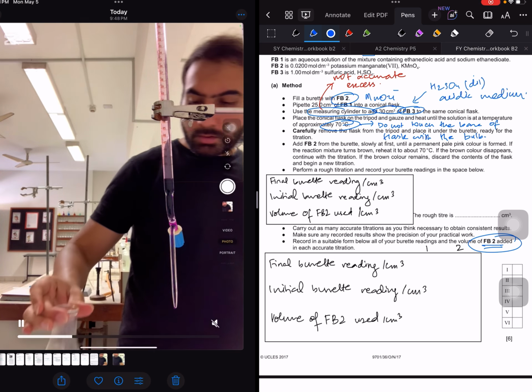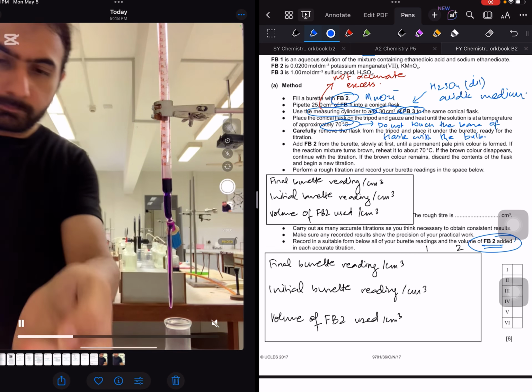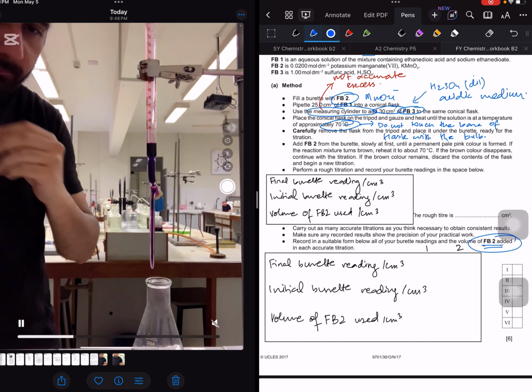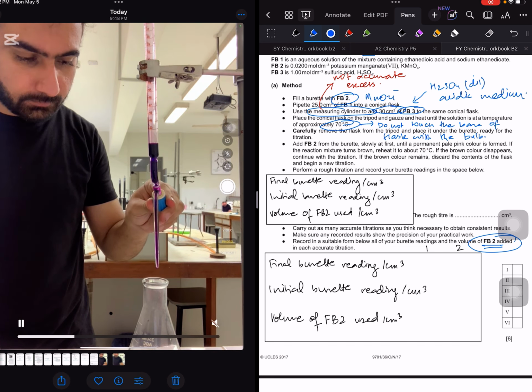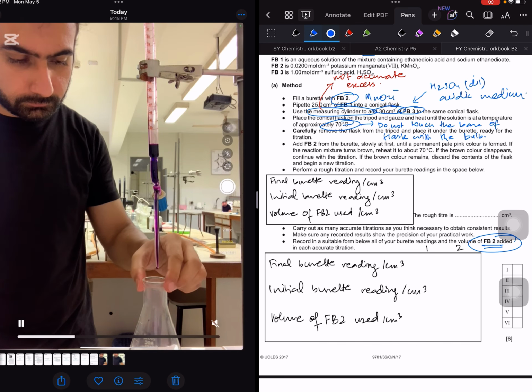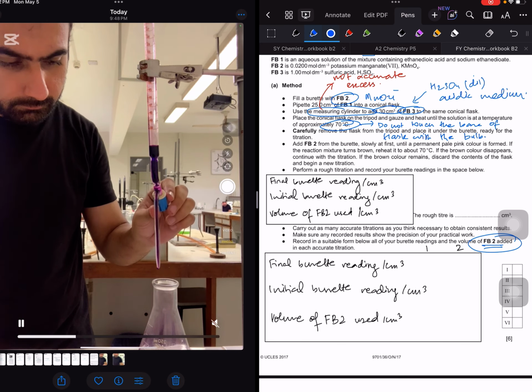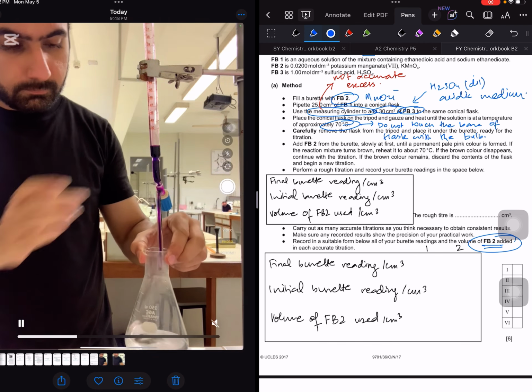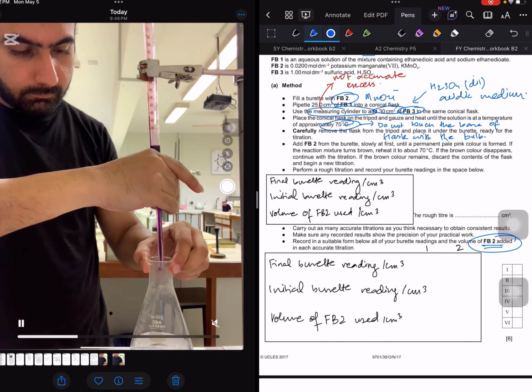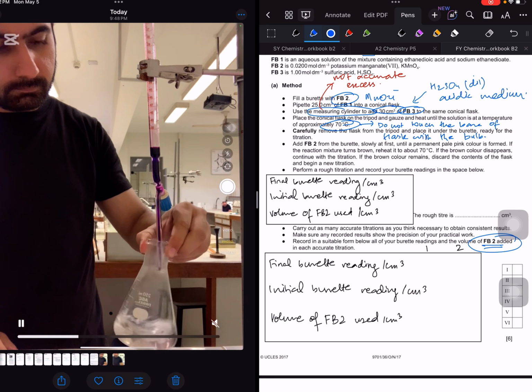So now when the temperature is ready, you have to make sure that the burette has been filled entirely. This is how you begin it. Obviously I'm just giving you a demo, so you'll transfer drop by drop, and you can see how the color will gradually change when you begin the titration. I am going to redo the titration obviously, but this is the beginning. You can see the color has gone, which means that the reaction is going on. Let me just go a little ahead.